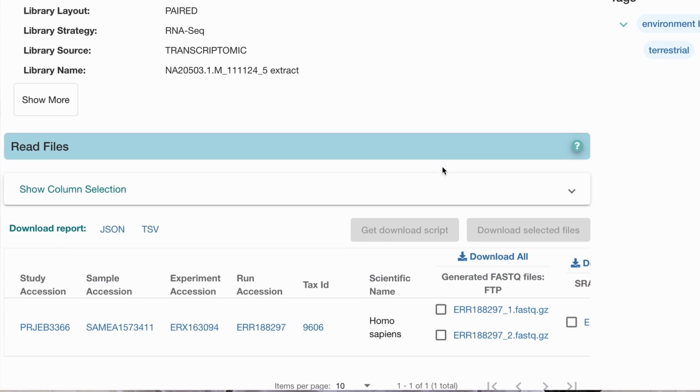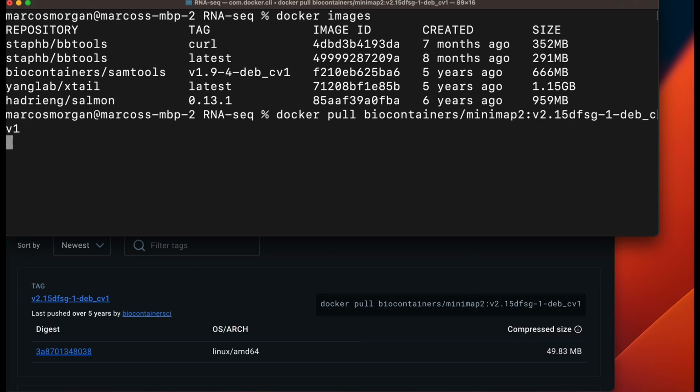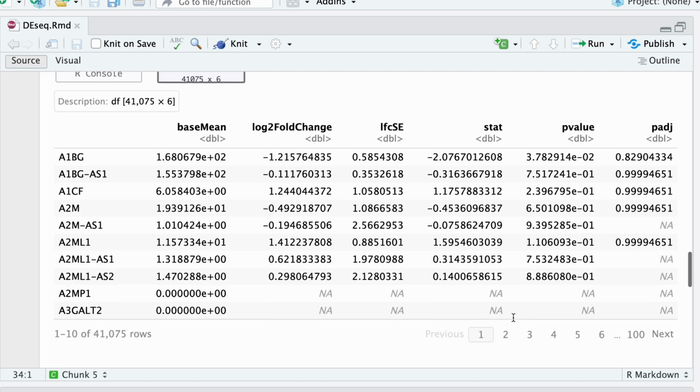I will then show you how and where to download all the raw data. I will show you how to install every single program in the pipeline, and in the process you will be looking over my shoulder at how to execute every single command, to go from FASTQ files with RNA reads to a table of differentially expressed genes. Let's get into it.